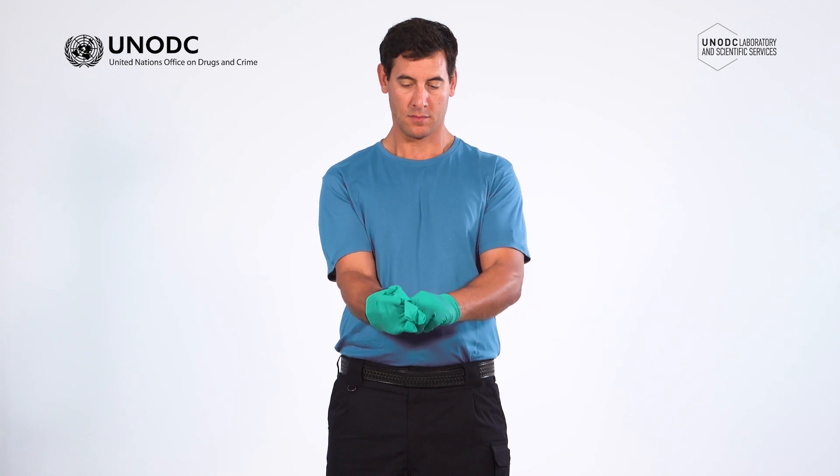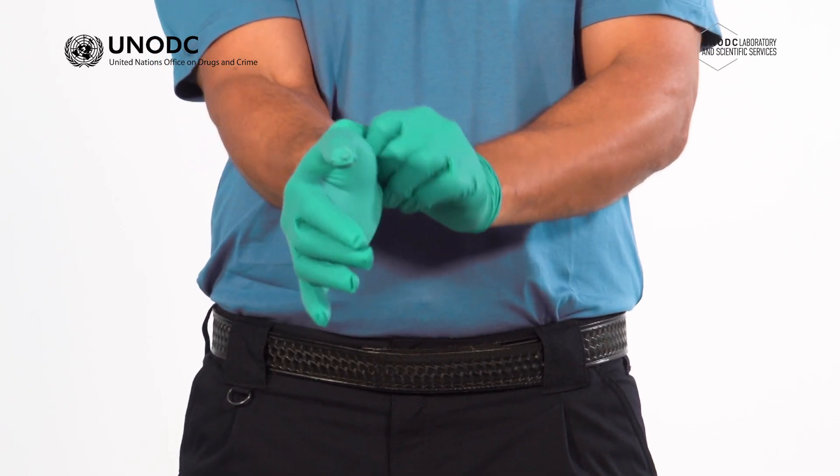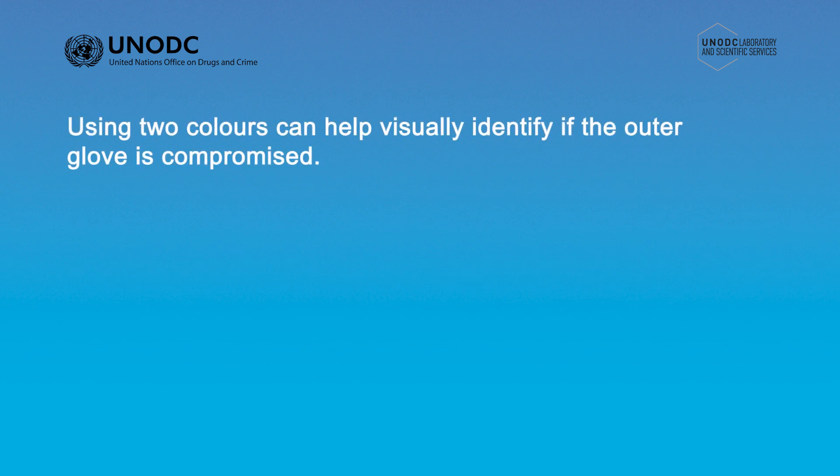When wearing a second pair of gloves, you must pay attention to the fit and sizing and make sure it's appropriate. If the gloves are too loose, the inner glove can easily come off when you remove the outer glove. It is not always possible to have two sets of gloves in different colors as shown here, but using two colors can help visually identify if the outer glove is compromised.